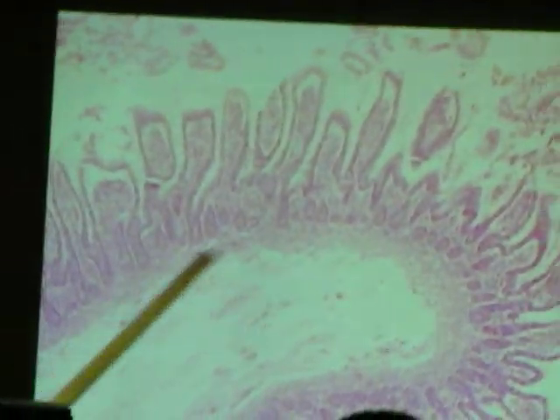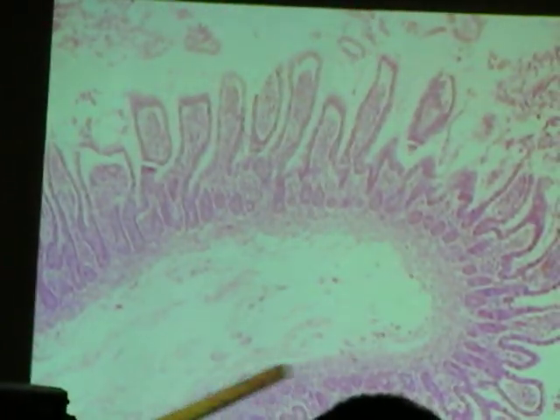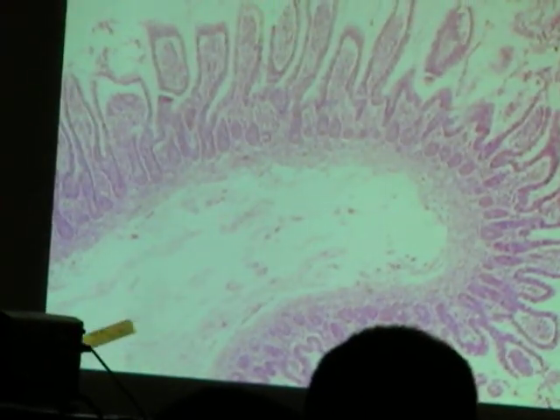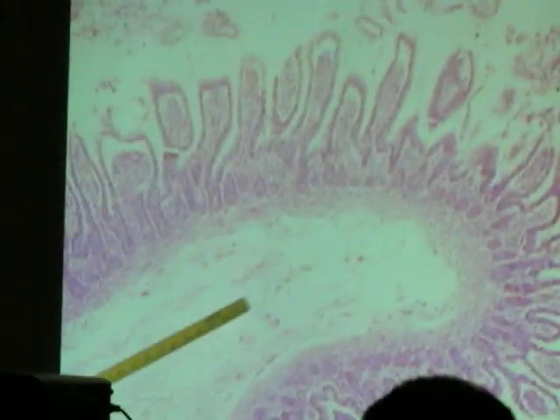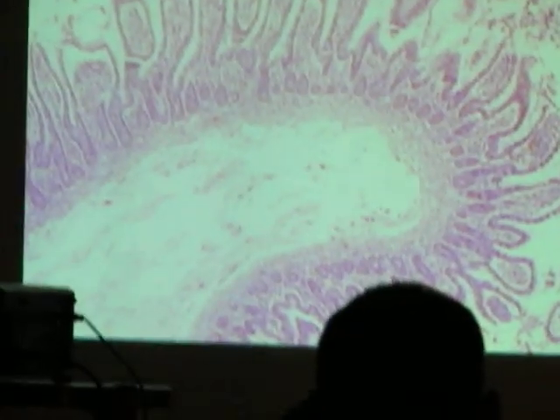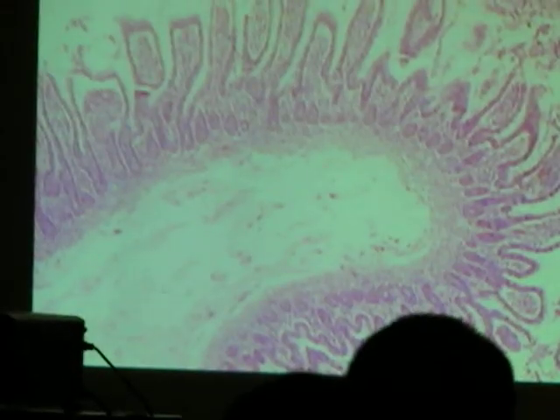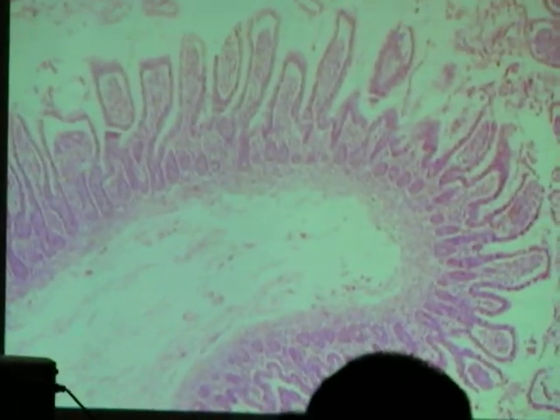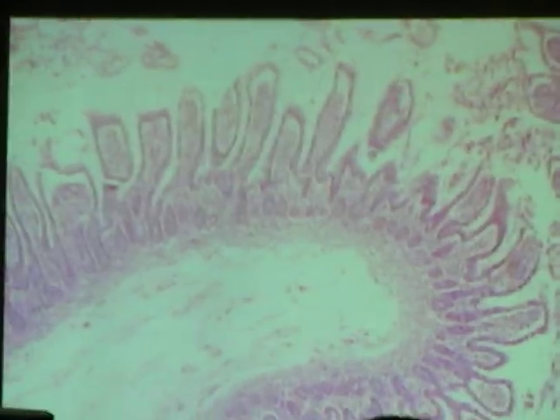And then again, our muscularis mucosa. What's this? Submucosa. So before we go on to the muscularis mucosa, let's go to the external and make the navigator a little bigger.